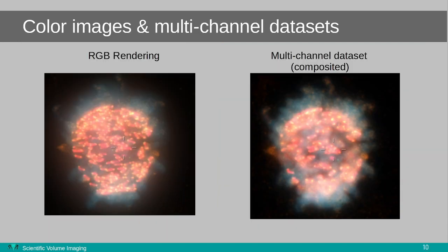It is important to make a distinction between two types of images: RGB images and microscope images of multiple fluorophores. As mentioned before, a smartphone camera often captures colored images by capturing information specifically of the red, green and blue parts of the light spectrum. Then it combines this into an RGB image.